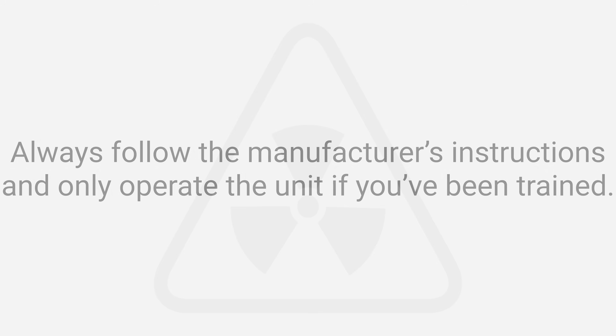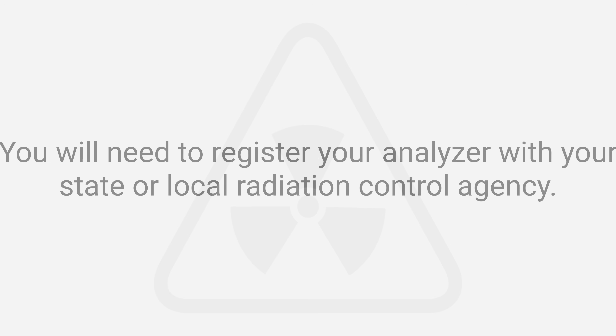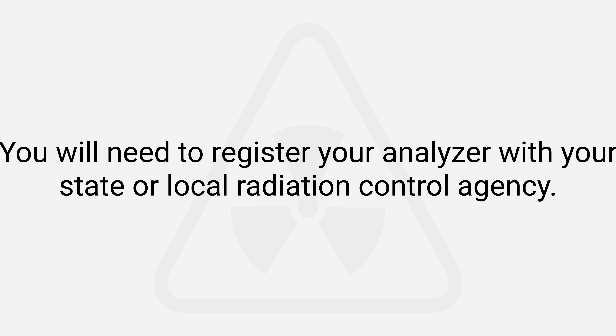Always follow the manufacturer's instructions and only operate the unit if you've been trained. Never point it at people, animals, or anything other than what you're testing. You will also need to register your analyzer with your state or local radiation control agency.